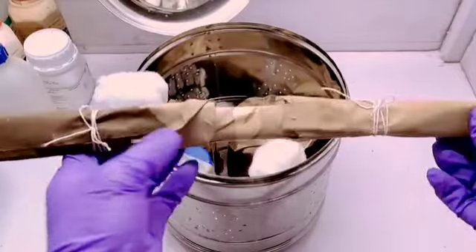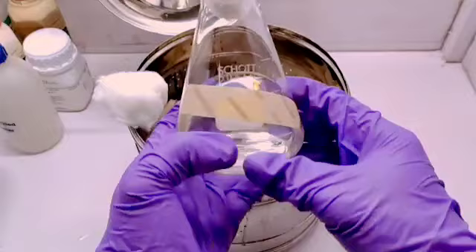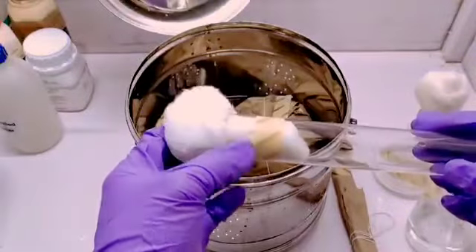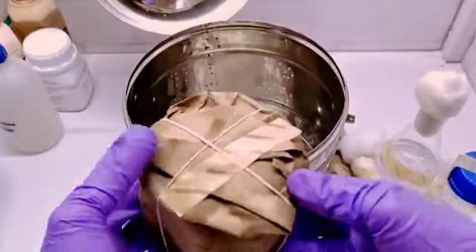Check the autoclave tape strips for black diagonal lines. If they appear on the strips, it means that the required conditions for sterilization were attained during the procedure. Unwrap the articles only just before use, preferably within the confines of a sterile LAF or inoculation chamber.